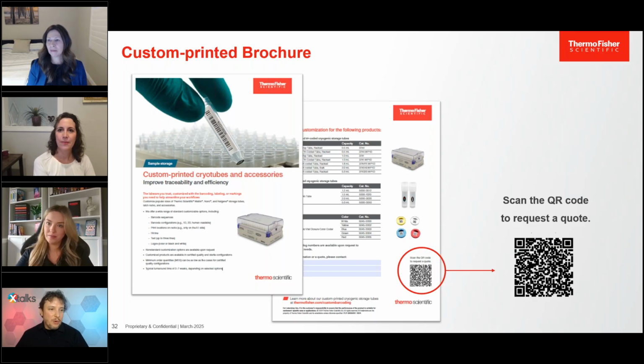Another question here, getting back to workflow: someone's wondering if there's a way to start adding customized automations to the lab's workflow.